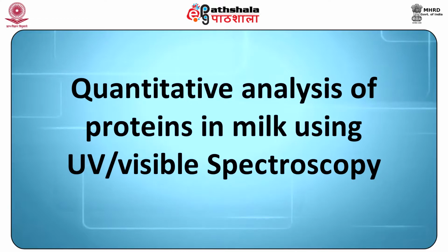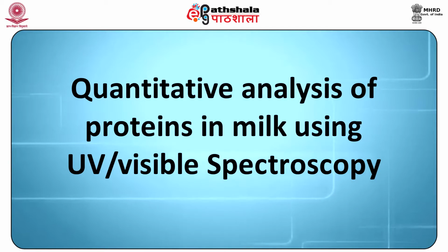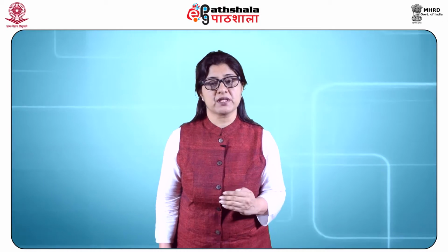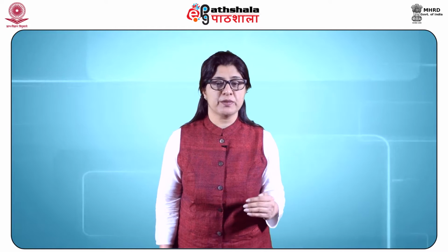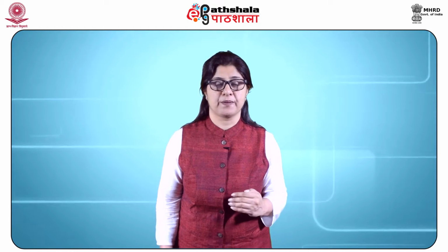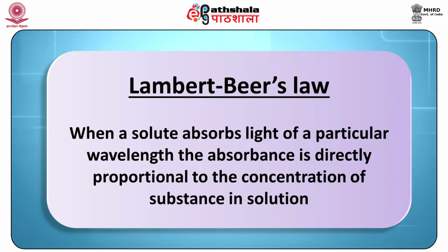Quantitative analysis of proteins in milk using UV visible spectroscopy. The quantitative analysis of proteins can be carried out with UV visible spectroscopy by measurement of wavelength of absorbance in protein assay and using the Beer-Lambert law. This law states that when a solute absorbs light of a particular wavelength, the absorbance is directly proportional to the concentration of the substance in solution.